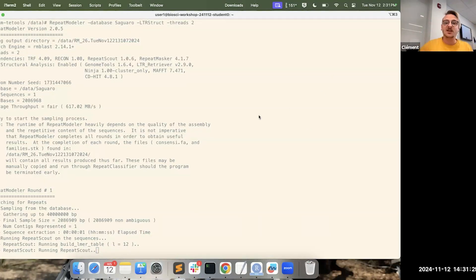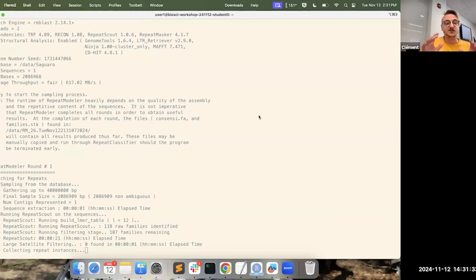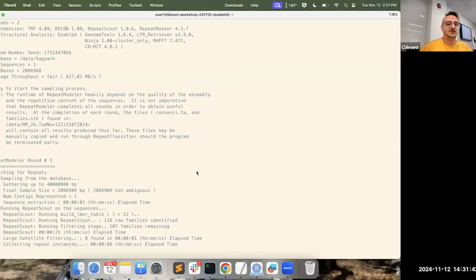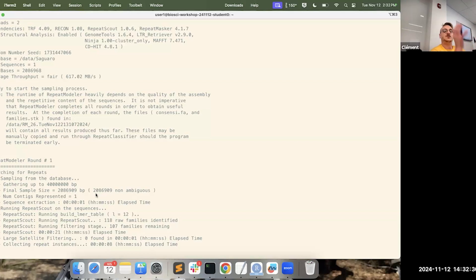While RepeatModeler runs, let me explain what it's doing. It's reading the FASTA file and sampling it, looking for exemplars of sequences to compare. For large genomes a sampling approach is computationally necessary. It looks for cluster of similar sequences and uses refinement algorithms to define the beginning and end of each TE sequence, representing them into families. Everyone should now be at Round 1 in their terminal.